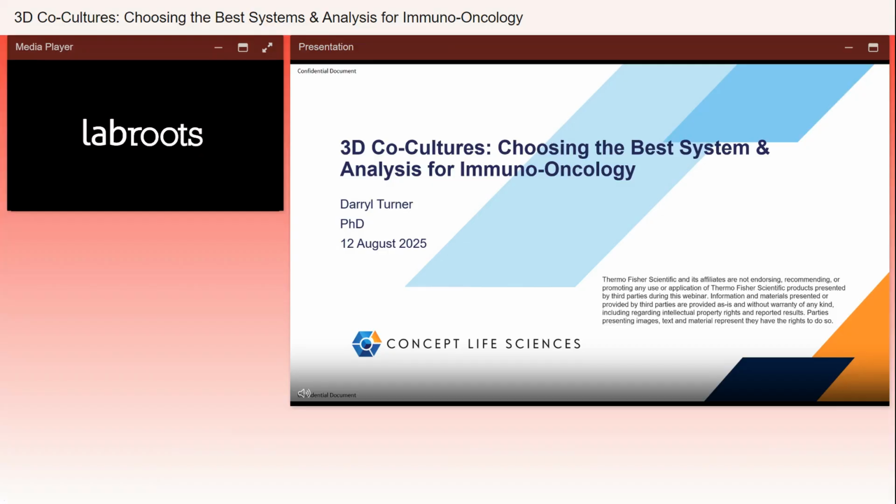So this webinar today is entitled 3D Co-Cultures, Choosing the Best System and Analysis for Immuno-Oncology. My name is Darryl Turner. The reason I wanted to do this topic was to discuss the methods that we are employing here at Concept Life Sciences to investigate these 3D co-cultures, the systems we're using, the challenges we've faced, and how we've overcome that by using these different systems.